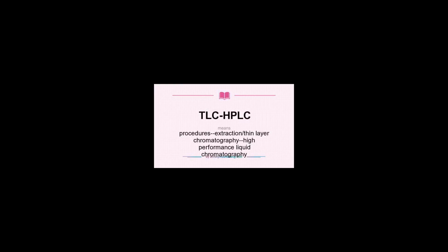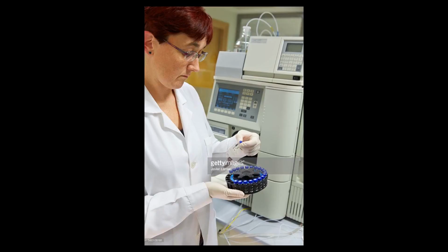Structural properties of the analyte molecule play an important role in its retention characteristics. In general, an analyte with a larger hydrophobic surface area, C-H, C-C, and generally non-polar atomic bonds, such as S-S and others, is retained longer because it is non-interacting with the water structure. On the other hand, analytes with higher polar surface area, conferred by the presence of polar groups, such as -OH, -NH2, -COO⁻ or -NH3⁺ in their structure, are less retained as they are better integrated into water.